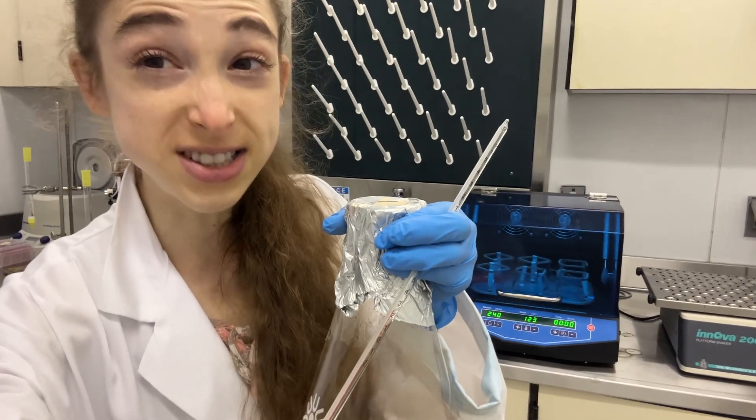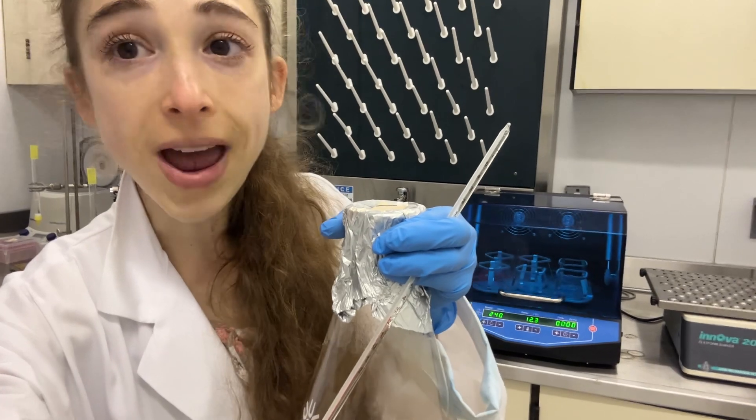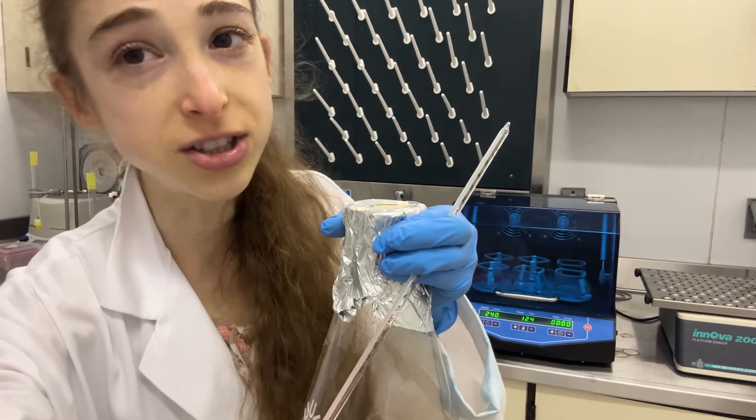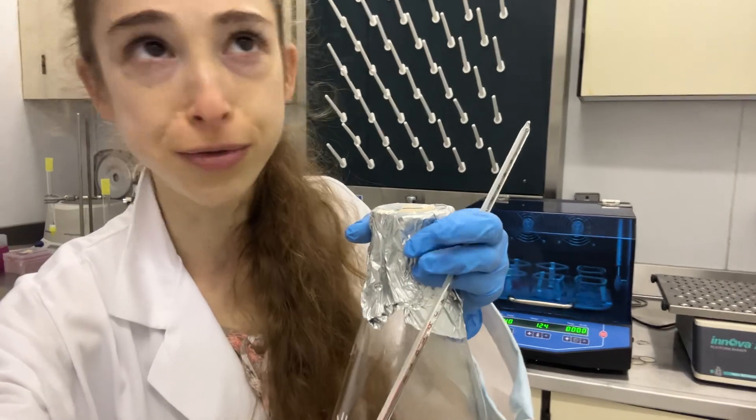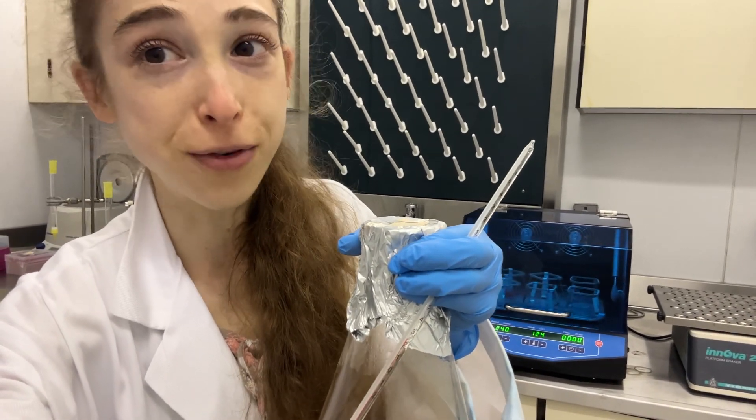Need to incubate at a temperature that's lower than room temperature, but don't have a refrigerated incubator? Go ahead and stick a normal incubator into a cold room and use that. Now your room temperature is a lot colder — in the case of a cold room, about 4 degrees Celsius.